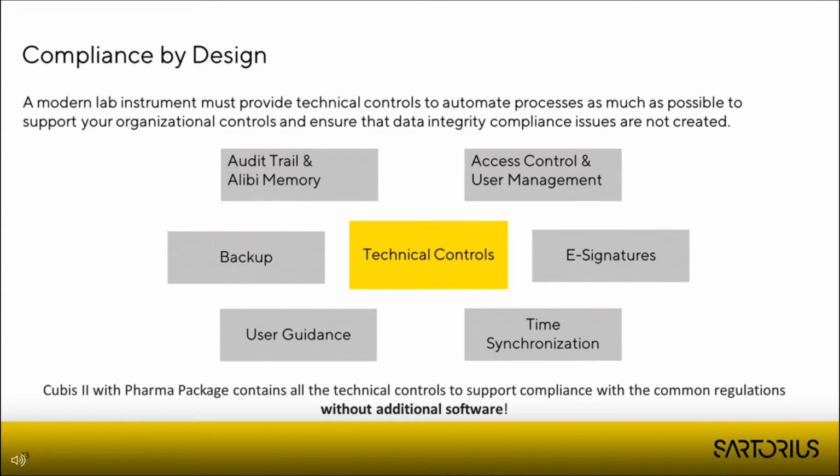Then it should have an audit trail functionality that logs all the events in the system, and especially for laboratory balances, it should also come with an alibi memory where all the weighing results are stored as a reference.